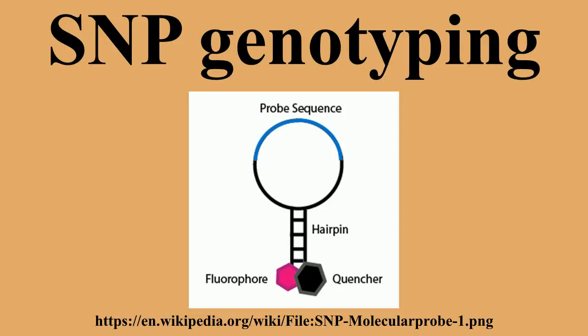If the target DNA does not contain an allele complementary to the probe's 3' base, the target DNA will produce a mismatch at the 3' end of the probe, and DNA polymerase will not be able to extend from the 3' end of the probe. The benefit of the second approach is that several labeled dNTPs may get incorporated into the growing strand, allowing for increased signal. However, DNA polymerase in some rare cases can extend from mismatched 3' probes, giving a false positive result.